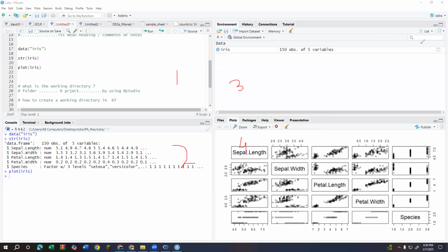Click on screen number 3, right side corner of screen number 3. Here you can find a project none button. At the top of the screen, right side, you can find a button named project none. In my case, it is showing me a Sidra.